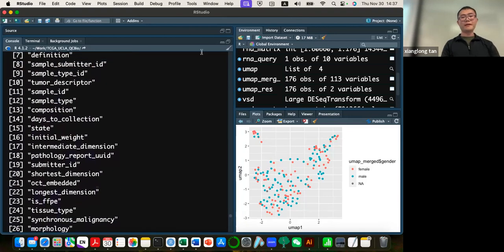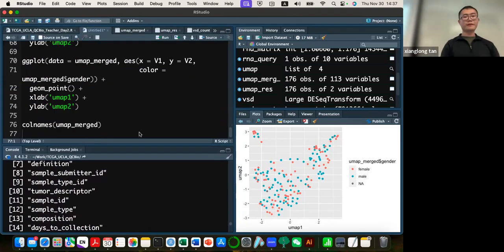So why don't we try different criteria to the different UMAP projection to see how the other parameters look like. And let's practice for 5 minutes with different criteria you want to cluster your samples. After that, we'll take a 10 minutes break. This will be the first demonstration of the downstream analysis. Let's start back at 2:55. And then we will go to the other example.